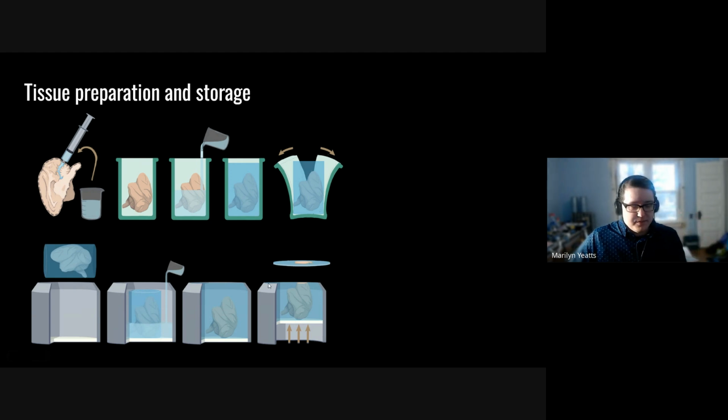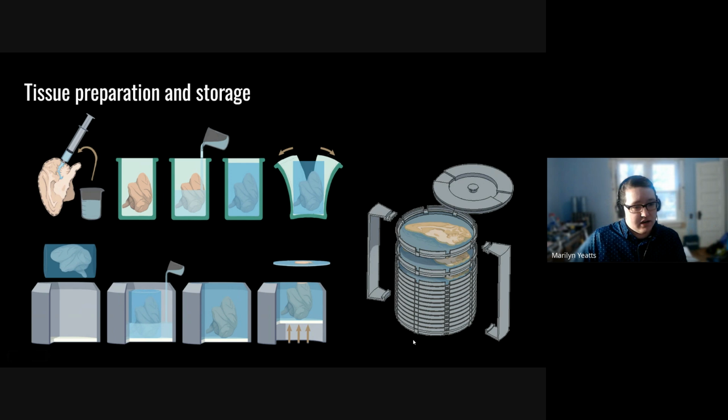One other minor point of clarity is that the imaging step happens between these two, basically. So before I slice, I will image, and then I slice, and then to save that slice, I put it into this custom designed and built 3D printed tissue storage system so that they can lay flat and be hydrated with PBS, because that's what I image in, and we want to keep the tissue obviously hydrated for future histology. This is generally how the preparation goes, and tissue from beginning to long-term storage.